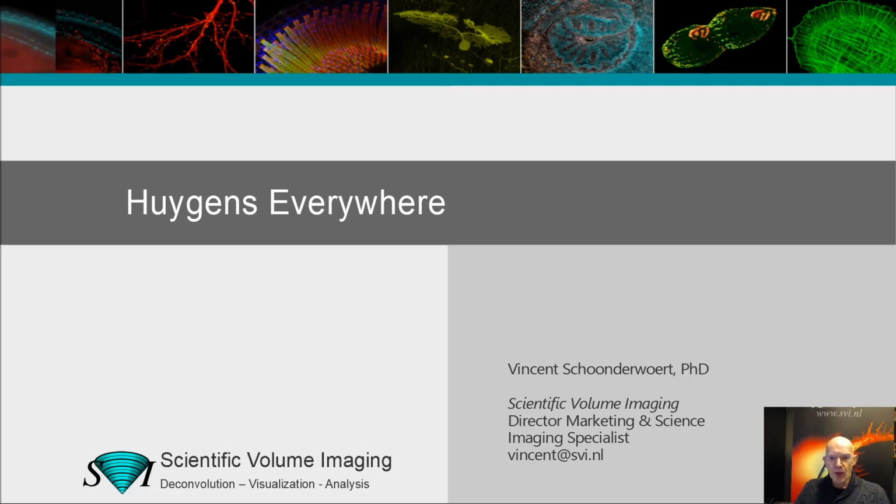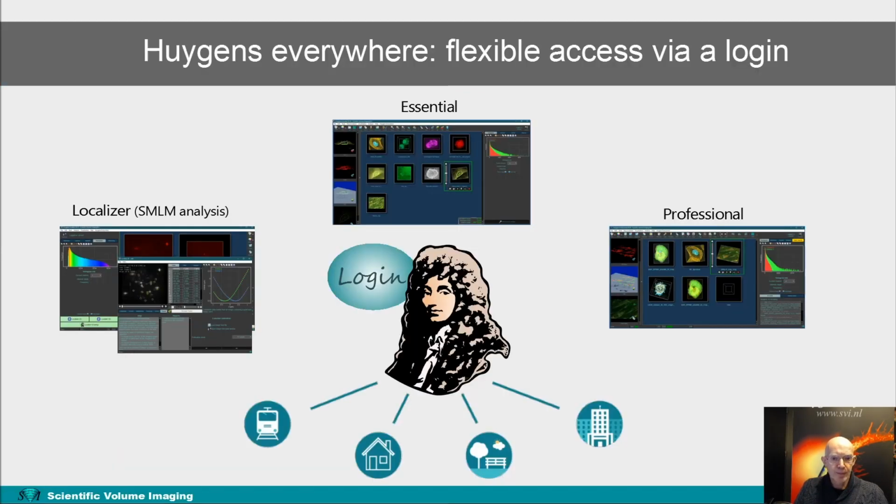Today I'm going to talk about the possibilities of accessing Huygens, with a focus on Everywhere use. Huygens Everywhere is a flexible way of accessing the existing Huygens packages, Localizer, Essential and Professional, everywhere with a login.